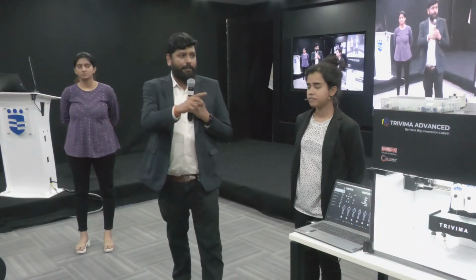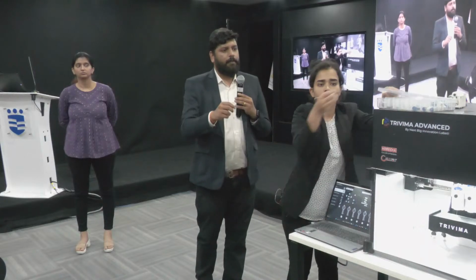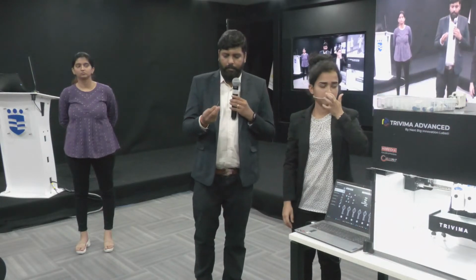When you print these cells, they go through a syringe that is really tiny, about 200 microns. Now imagine a bunch of cells going through a small syringe like this. The cells start to lose their viability when they go through so much stress and strain. So you first understand how the cells have been printed. That is called the day 0 or day 1 test that we do.